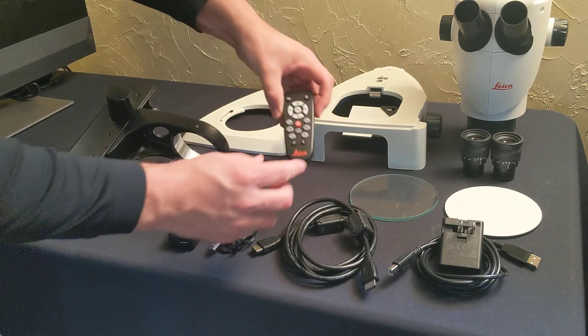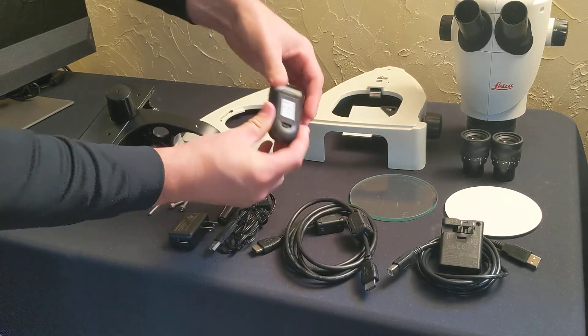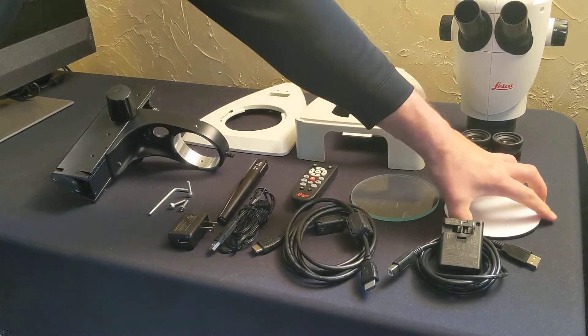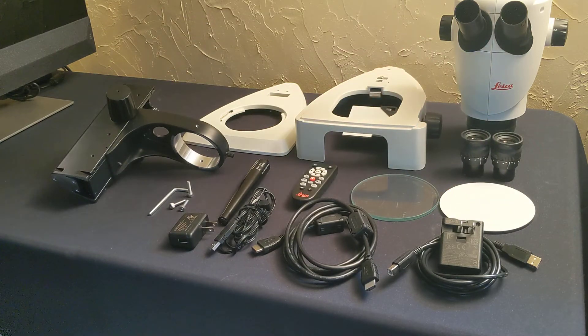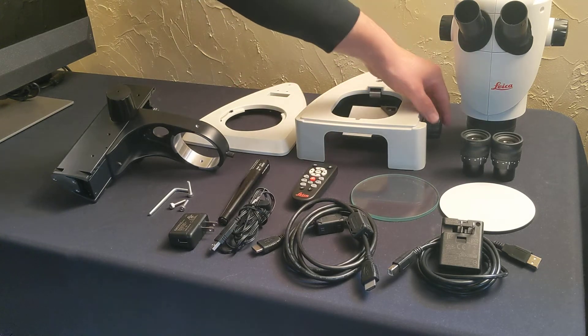Your remote control — I have the batteries installed already. You'll have a glass plate, as well as a black and white stage plate, two eyepieces, the microscope body, and the transmitted light base with the mirror.